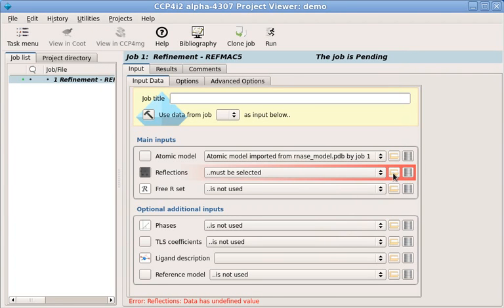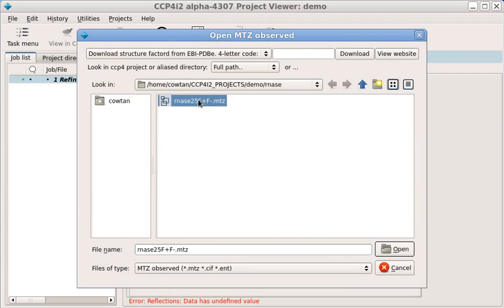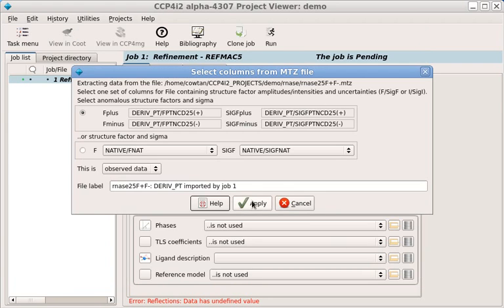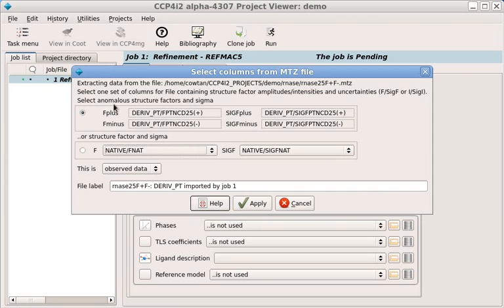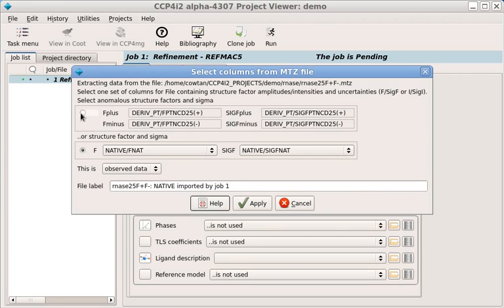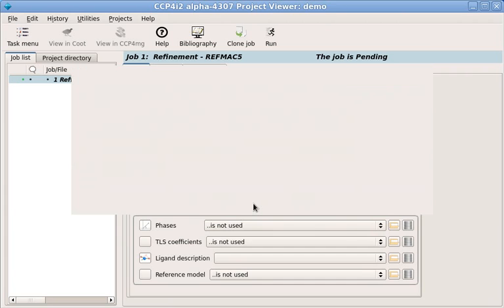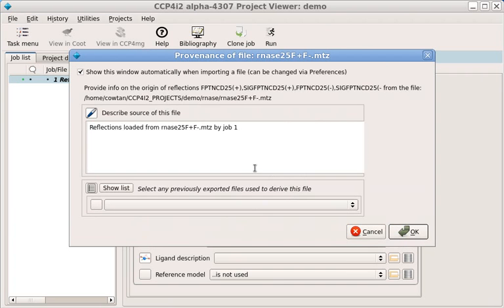Now we need some observations. These happen to be in an MTZ file, which can hold lots of different data sets. So when we select the file, we also have to select which data sets we want. The data may be intensities or amplitudes, with or without anomalous differences. In general, tasks will take any kind of observations. So by default, we'll use the richest form available. In this case, we have anomalous Fs, so we'll use those. It's generally better to use intensities if you have them.